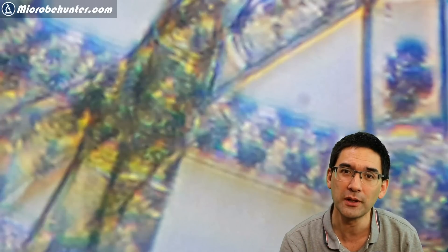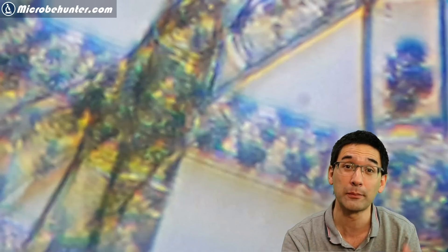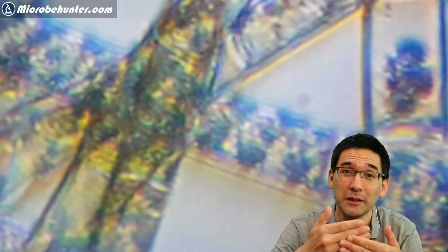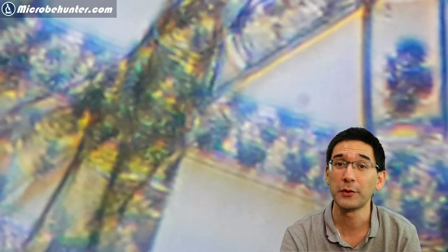It means you almost see almost like a double image. The reason being because the light - the different colors of the light are refracted differently by the optics of the microscope. Now let's try my other microscope, the big one so to say.